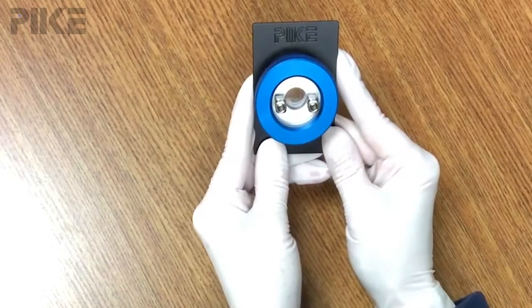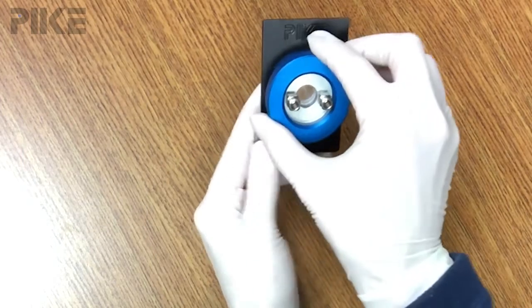Pike offers two versions of the demountable liquid cell. Let me show you the difference. Here's the Pike demountable liquid cell — let me take it apart for you.